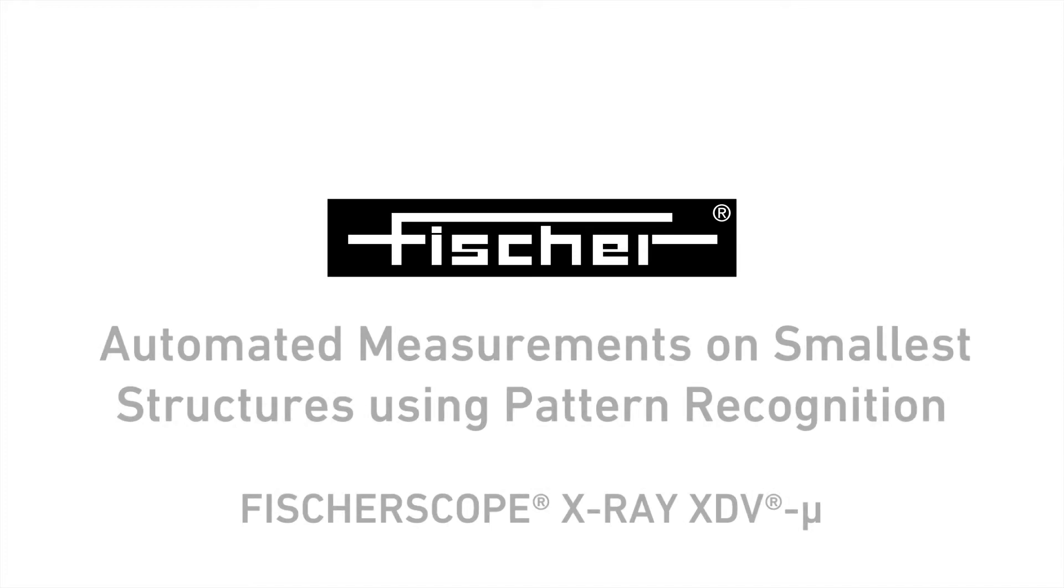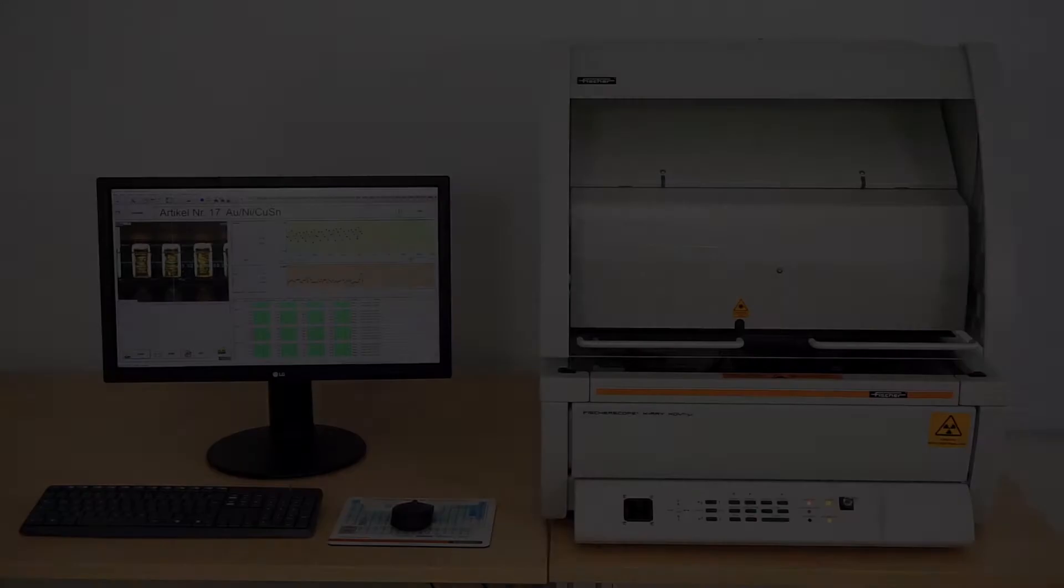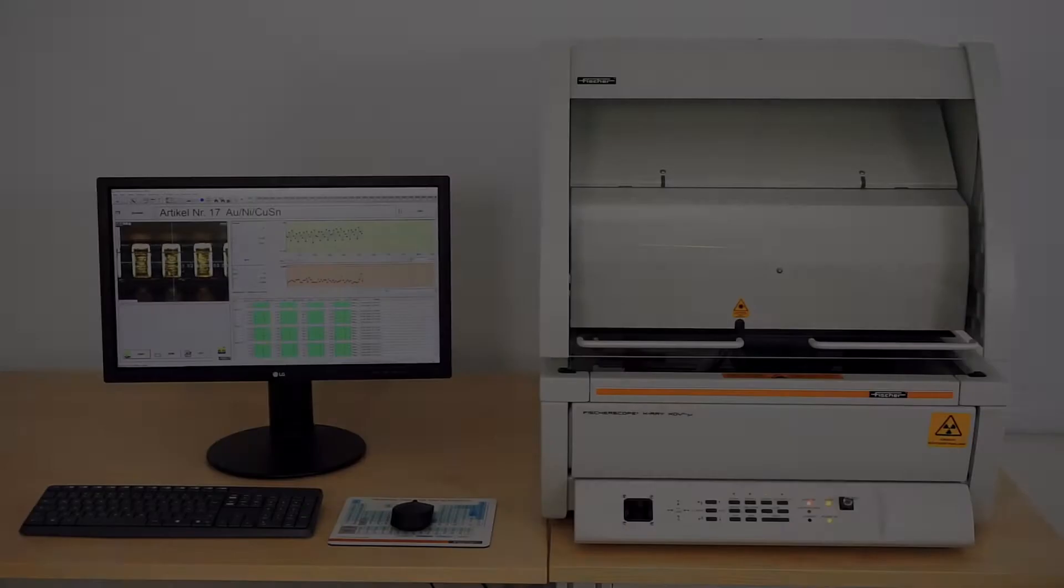By using the FISCHERSCOPE X-RAY XDV-µ, measurements on the smallest structures can be performed. Polycapillaries, manufactured in-house at Fischer, focus the X-ray beam on a very small spot.